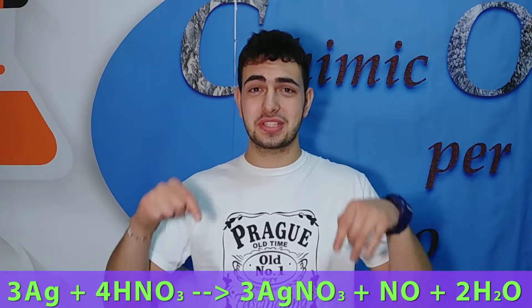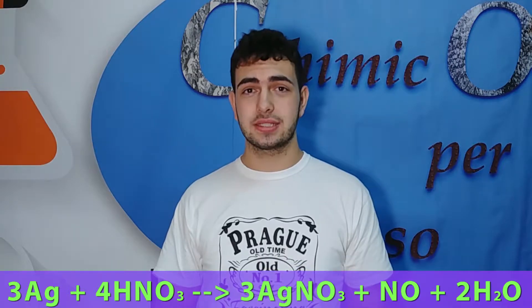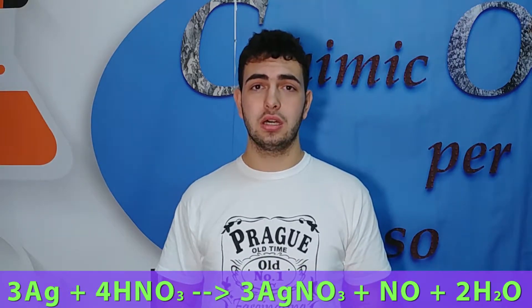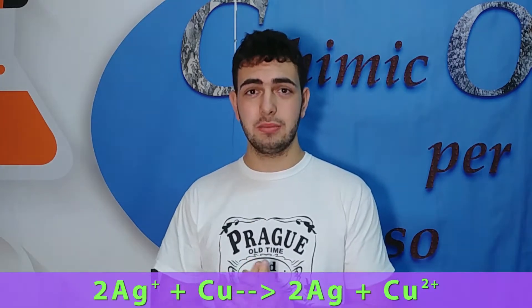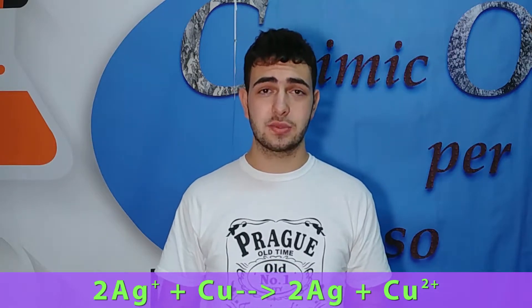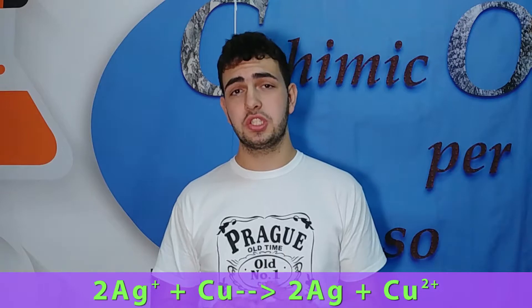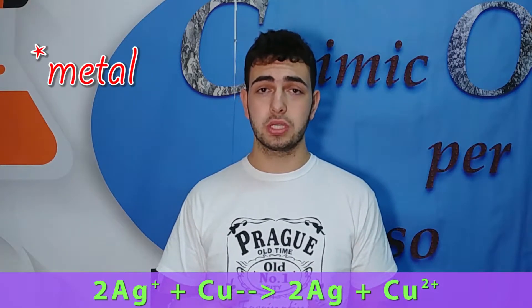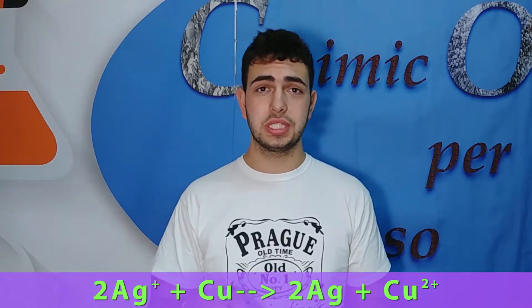For this experiment the reaction is the following: metallic silver reacts with nitric acid to produce a silver ion (Ag⁺). This silver plus one ion is the same one that precipitates when it reacts with copper. In fact, this is a redox reaction in which silver is a more noble metal, and this is why it precipitates during this reaction.